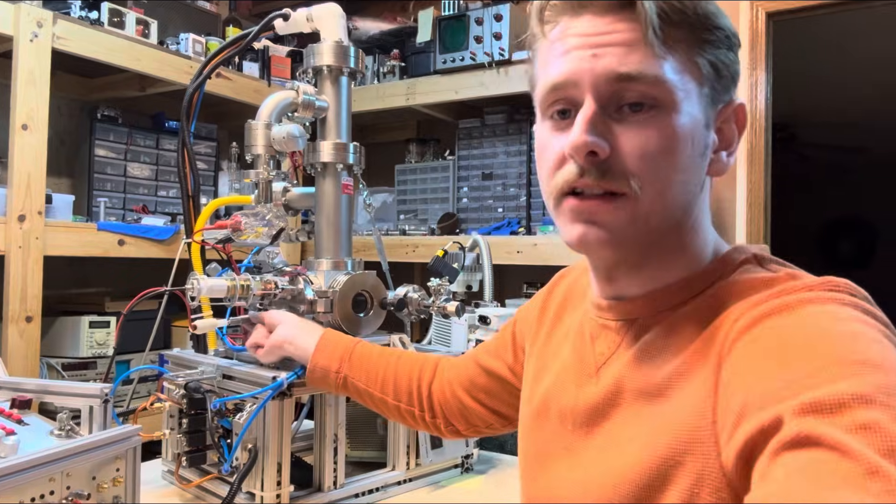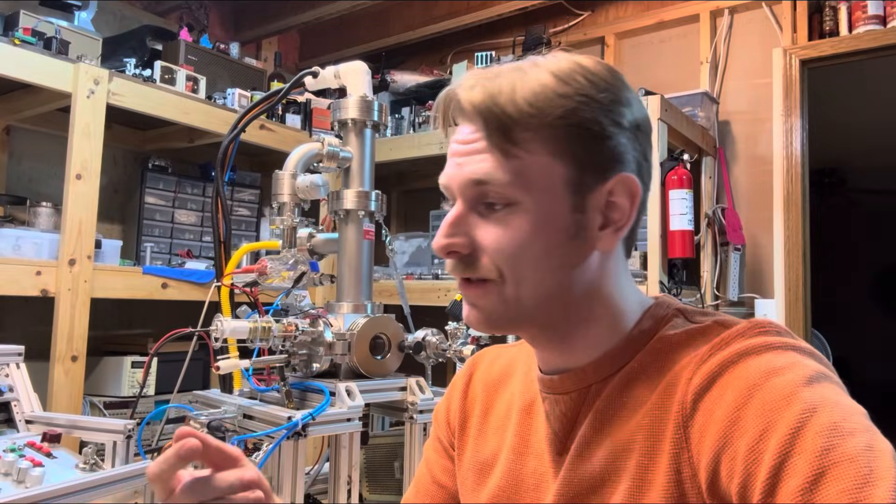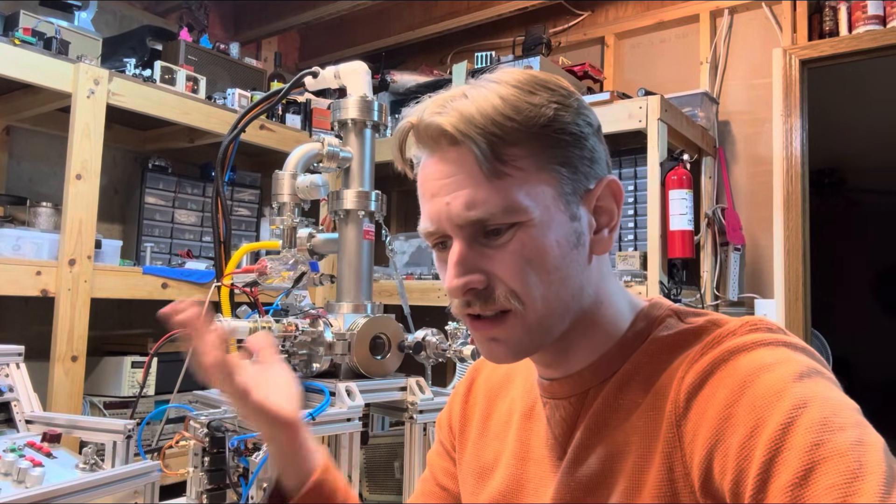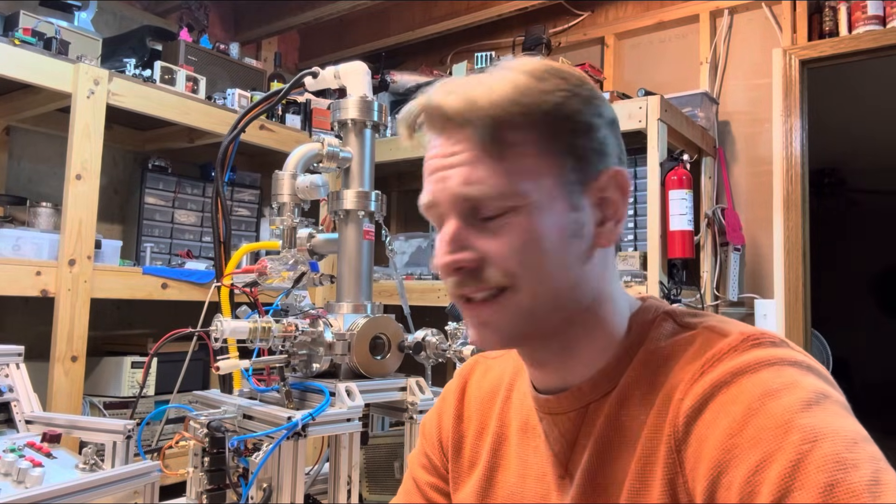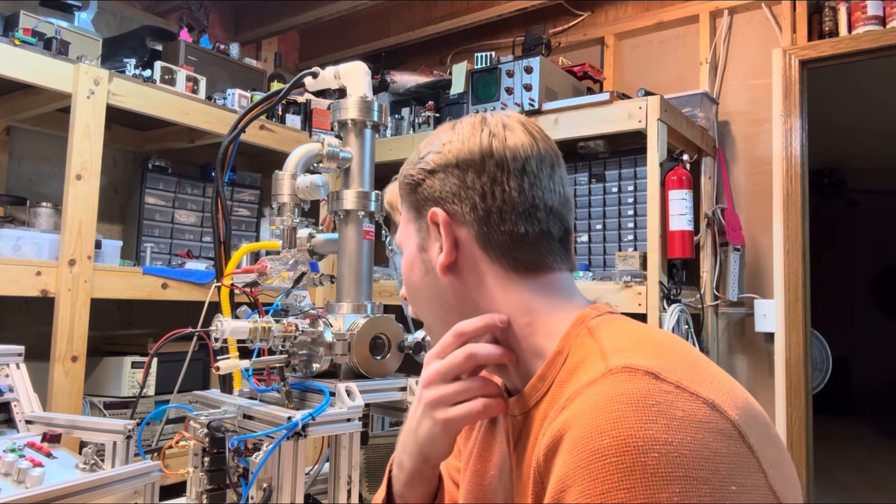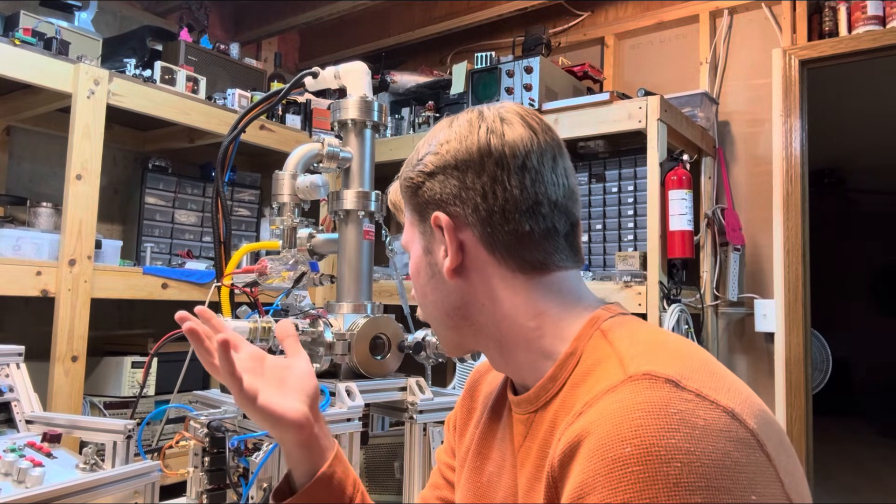This right here, let me show you here. Get a load of this gear right here. So this is a 20 kilovolt BNC connector. At first, I thought it was an SHV or an MHV because those are like 10 kilovolts. So I bought the cable for it, which was not cheap. And then it didn't fit. And I was like, well, what could it be then? Well, it turns out there's a 20 kilovolt version. And it's bigger. And it's just a trillion times more. Like, I think the cable, I saw cable for like $560. I ain't paying that. That's not going to happen. So I just basically stuck a wire in there and called it good. If it looks nice, then I'm happy with it.